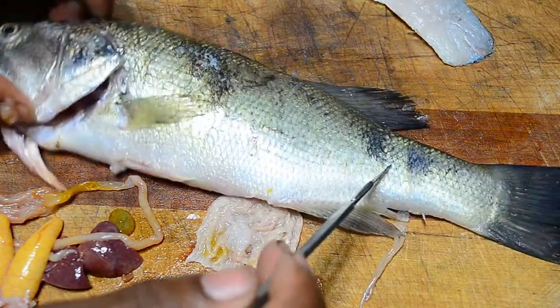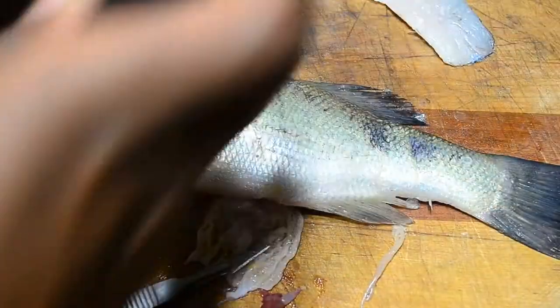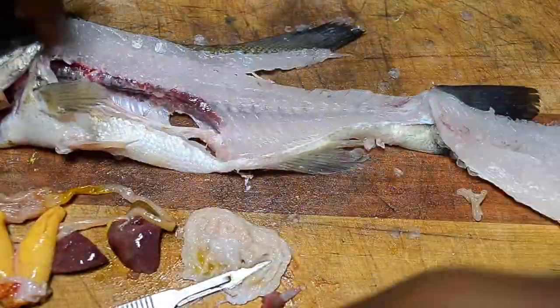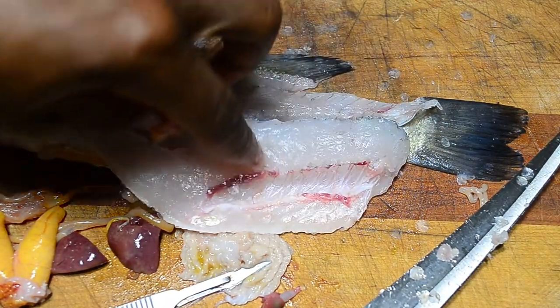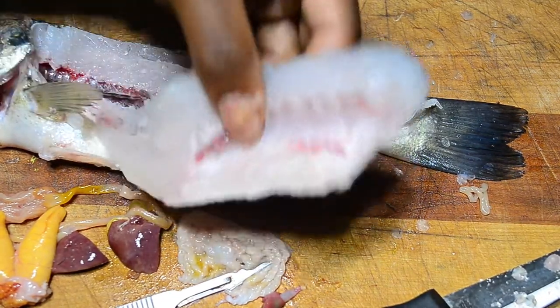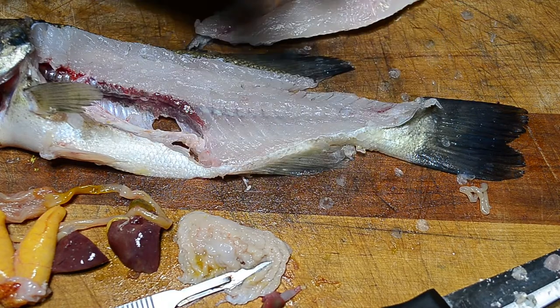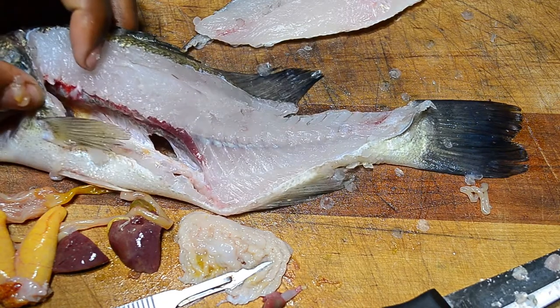Let's flip this over and fillet it. I filleted that horribly — I still got the ribs in there, this knife is not that sharp. But it looks like this side has fewer parasites than the other side.